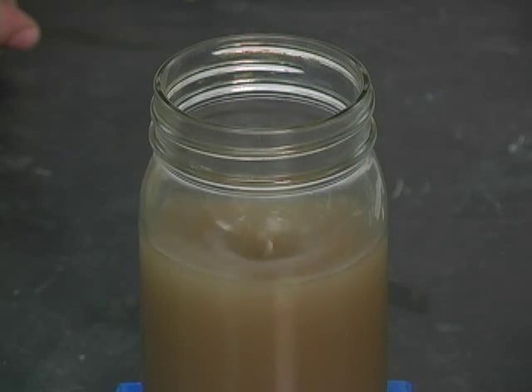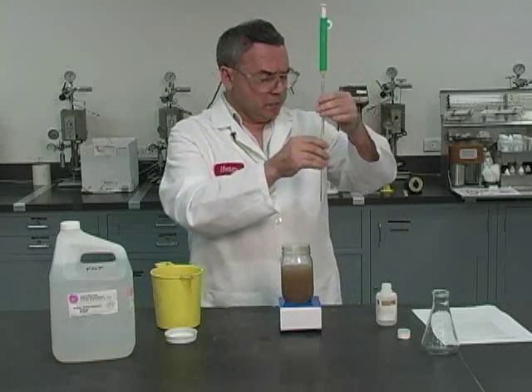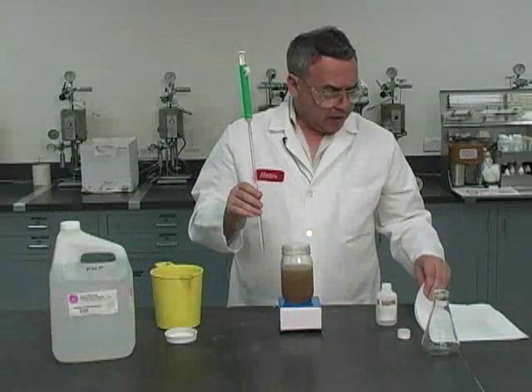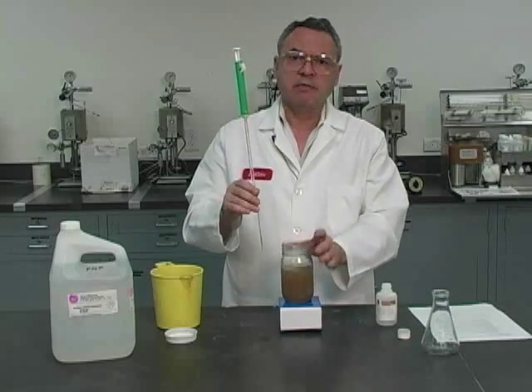Yeah, the pink color is gone, so I'm going to report the acid volume as 0.8. That would be the amount of acid I used divided by the 2. That's going to give me alkalinity of 0.4. This is the alkalinity of this invert emulsion.